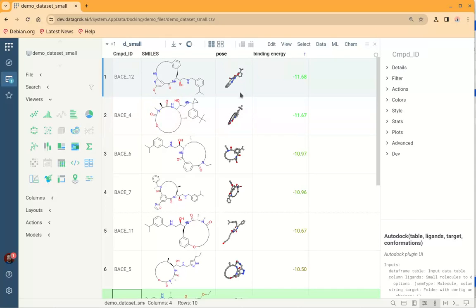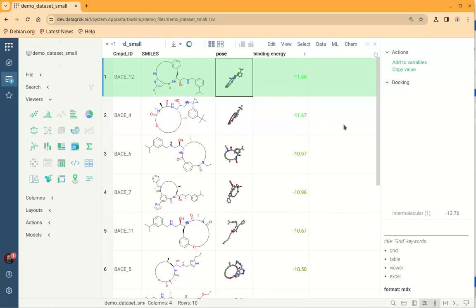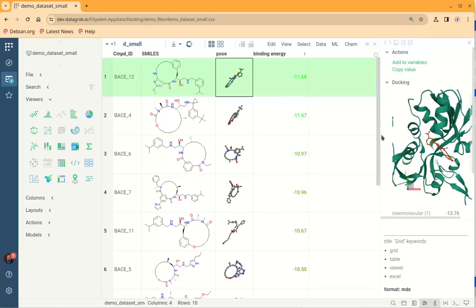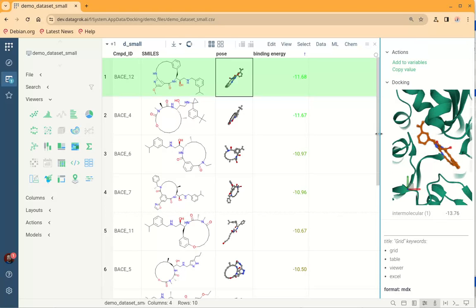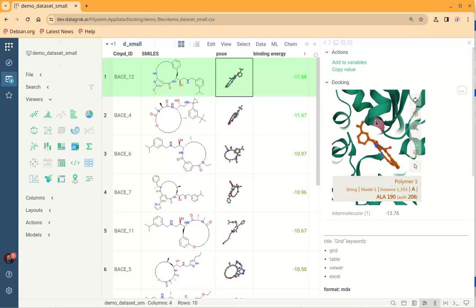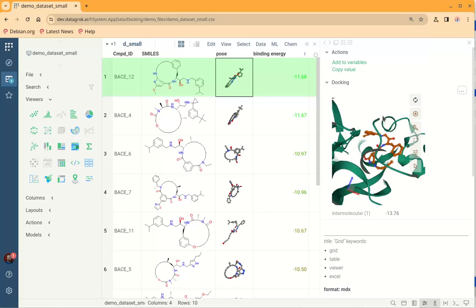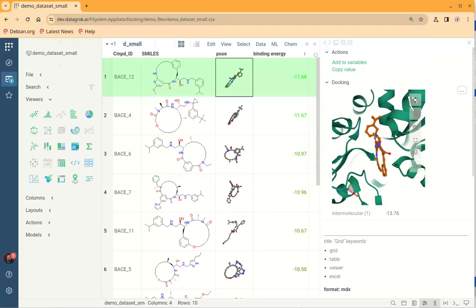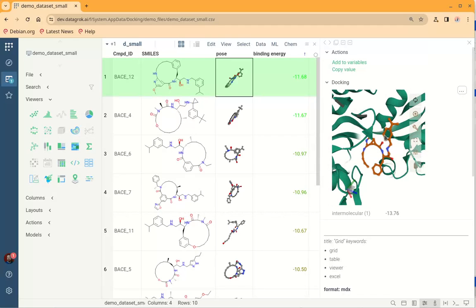By clicking on the pose, in the details we will see the three-dimensional viewer with our target receptor molecule and the small molecule, so we can visually explore how the small molecule fits into the ligand binding pocket of our macromolecule.